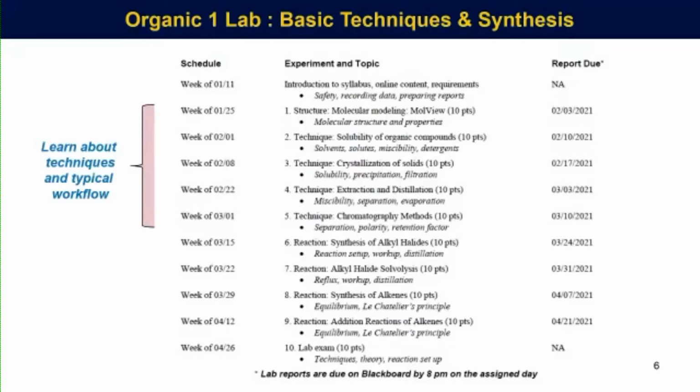So I'll talk about some of those experiments we did, particularly with Beyond Labs. And then the more challenging part of this was going to be the synthesis component. How do we do that?